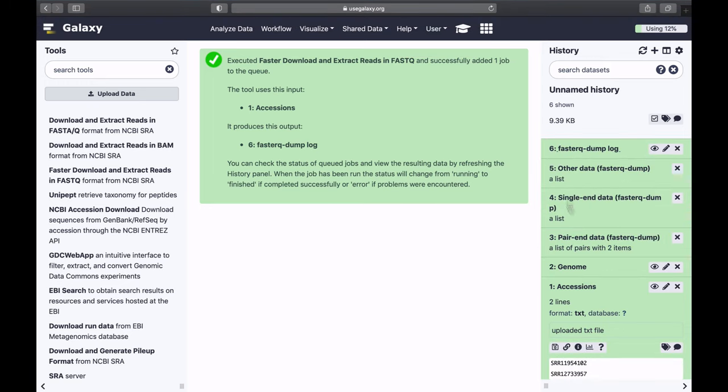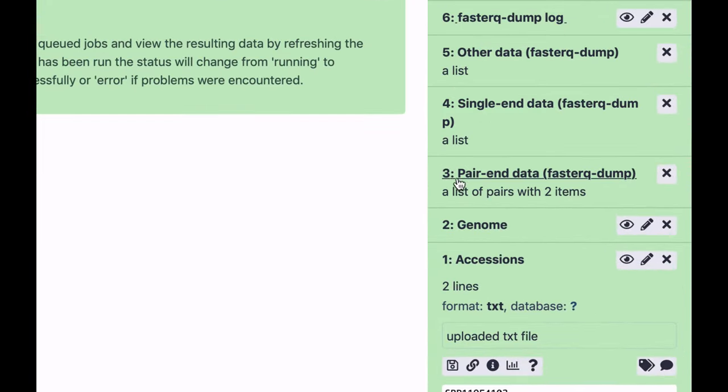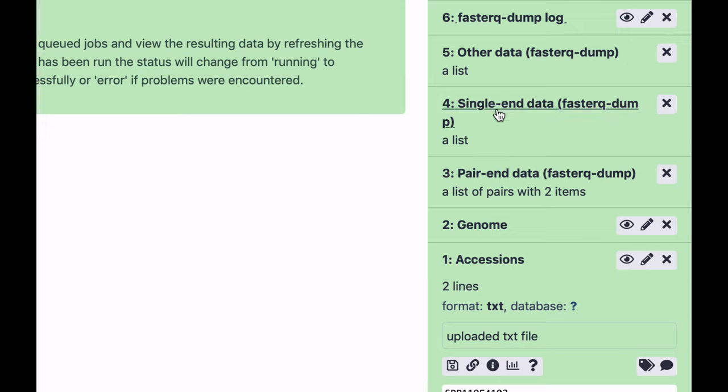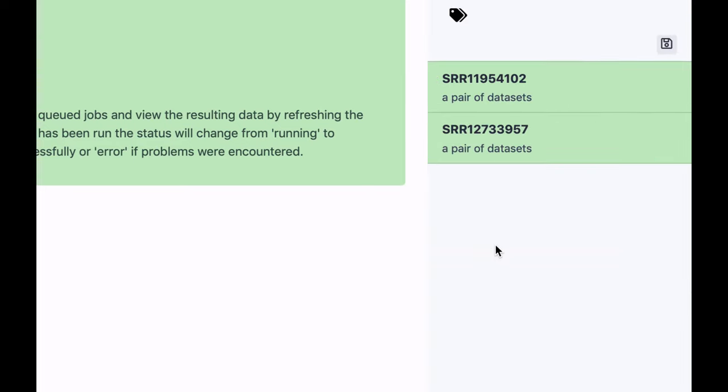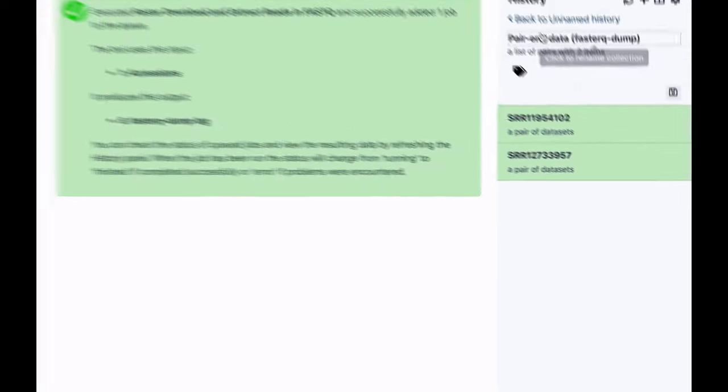Now this is finished, you can see that this tool generates a number of data sets. A priori, you usually don't know whether the data sets you're downloading are going to be single-end or paired-end data. So it creates two collections, a single-end collection and a paired-end collection. In this case, only paired-end collection contains any data sets, as you can see. Therefore, both of these are paired-end data sets.